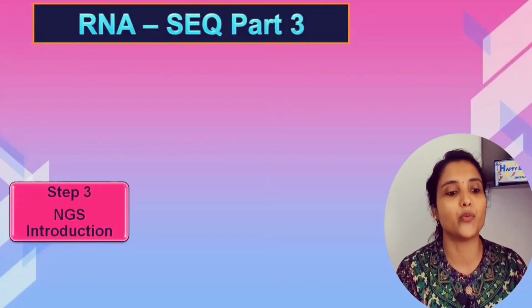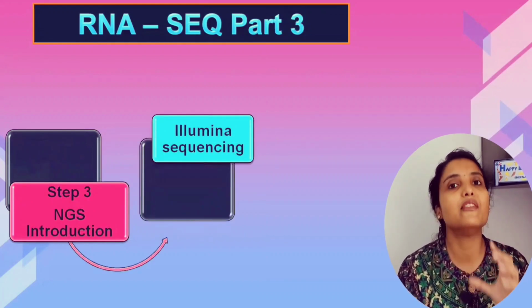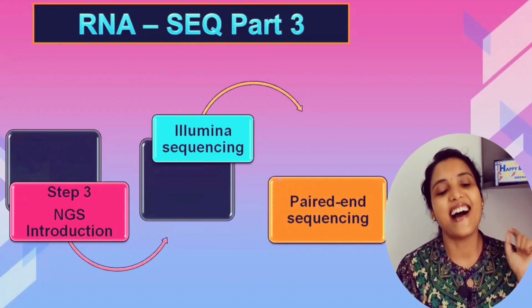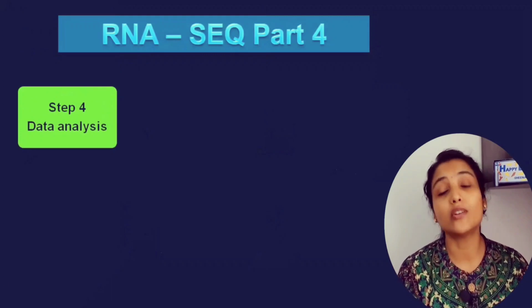In part 3 of this video, we'll be focusing on the sequencing step. So we'll be understanding what is next generation sequencing, and specifically we'll be learning what is sequencing by synthesis by Illumina. And under that, we'll also be learning what is paired end sequencing. Okay. So part 4 of the video will focus on data analysis.